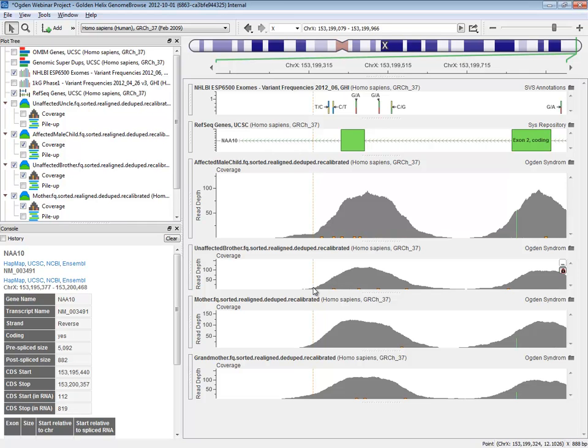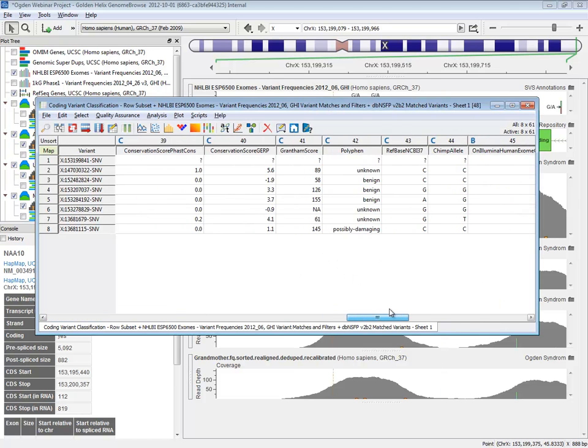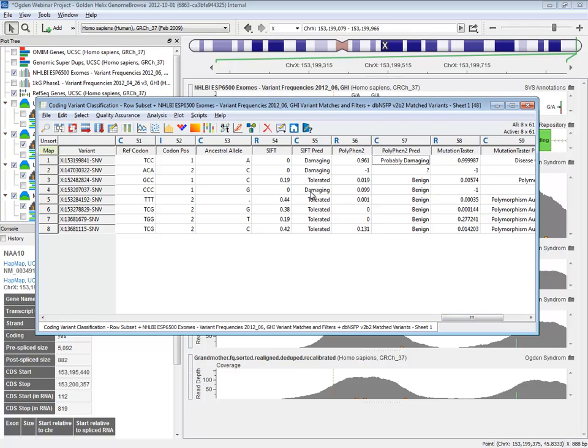Next question, prediction tools usually provide conflicting prediction results. How do you resolve one prediction as benign while another predicts as deleterious? In fact, we were looking at that exact case in our report. There was one of these that is benign versus deleterious. At the end of the day, if you're doing clinical genomics, you don't stop here. This is just informing you on which candidate variants you want to continue on to functional validation, etc.